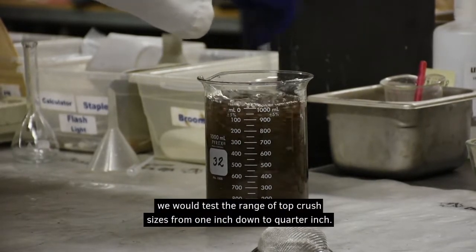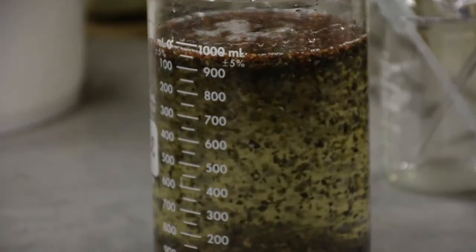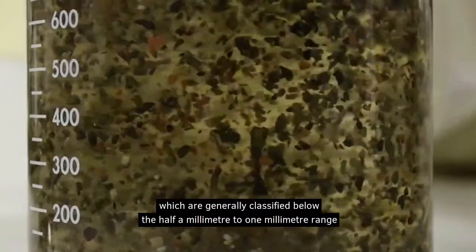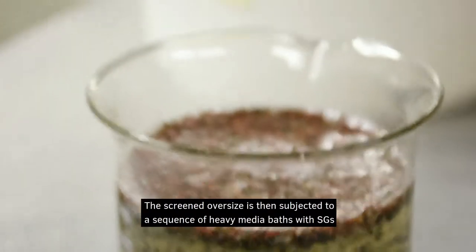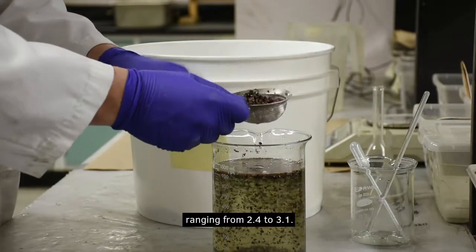Here at our labs, we will test a range of top crush sizes from 1-inch down to 1/4-inch. The fine particles, which are generally classified below the 0.5mm to 1mm range, are removed by screening. The screen oversize is then subjected to a sequence of heavy media baths with SGs ranging from 2.4 to 3.1.